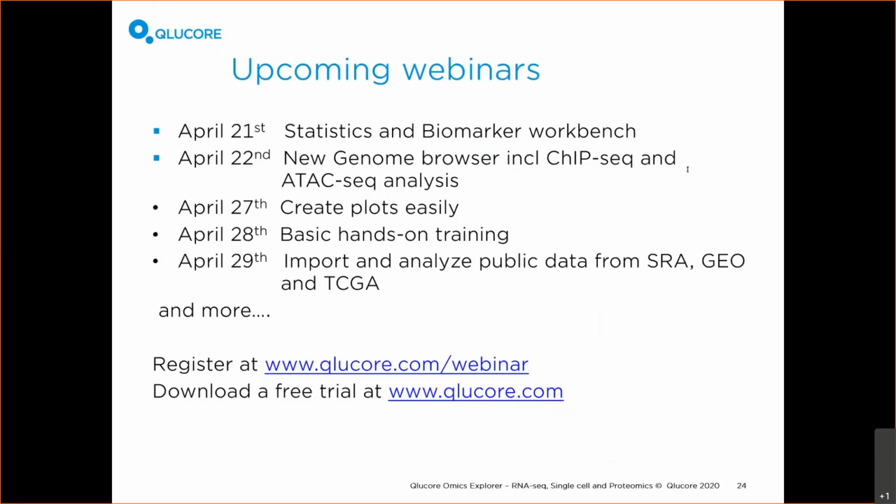Okay, is the subsampling done randomly? Does the subsample change by repeating? Yes, it does. It's a random process. So you can do it several times if you want to verify your results.